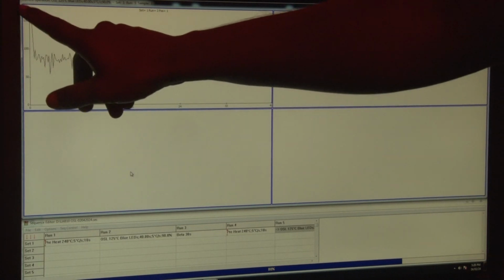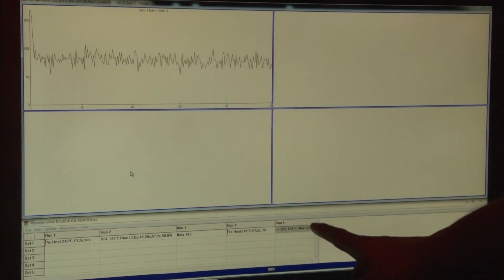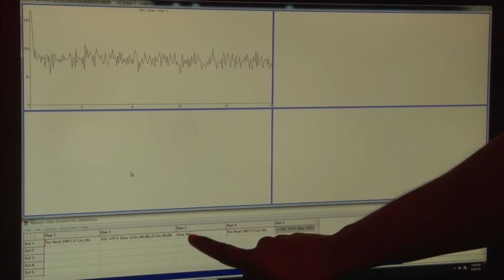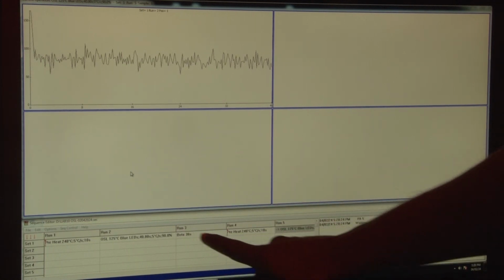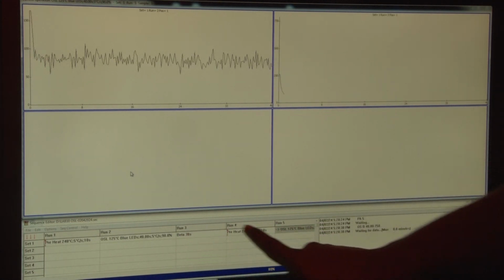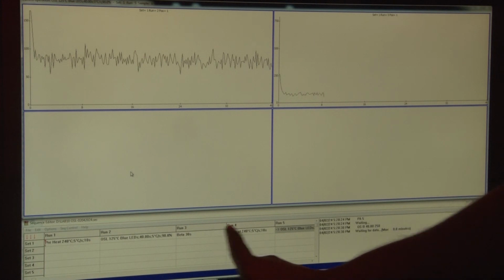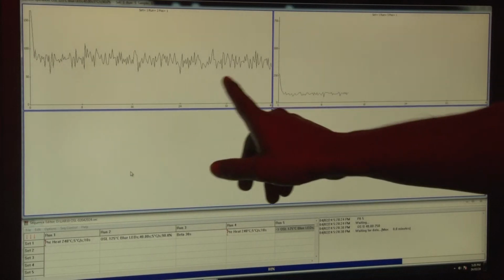The first curve which you are seeing over here is the natural curve, the radiation which has been accumulated in nature. On the second curve, we have provided the 30 second beta radiation, that would be around 4 to 5 gray. So that we have assigned, and then we will stimulate that radiation in the laboratory by applying the blue LED. Then we will compare whether the curve of this one is similar to this one or not.